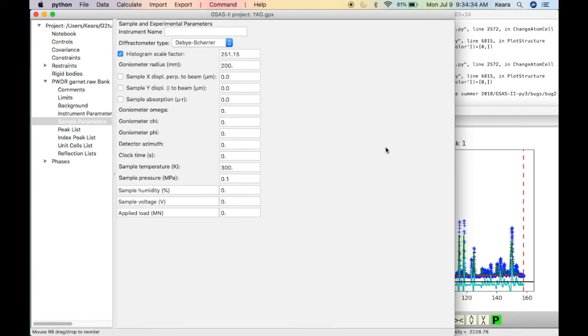What appears to be an error includes some structural features which may be from site fractions for the FE-AL sites. The error may also be something about the peak positions, and that may be from a lattice parameter. We can introduce all of these parameters now.